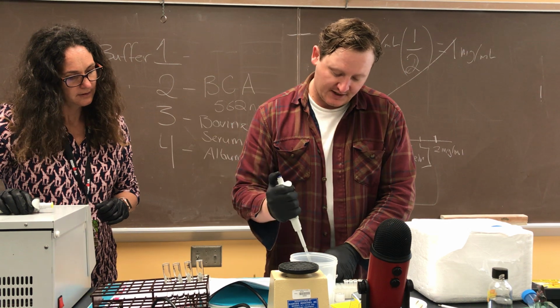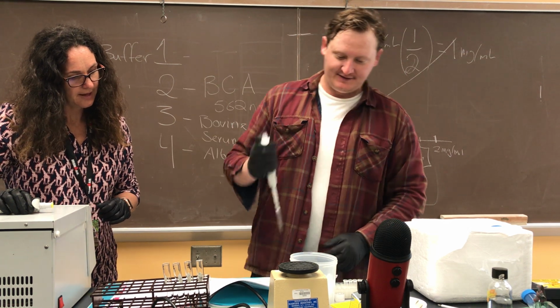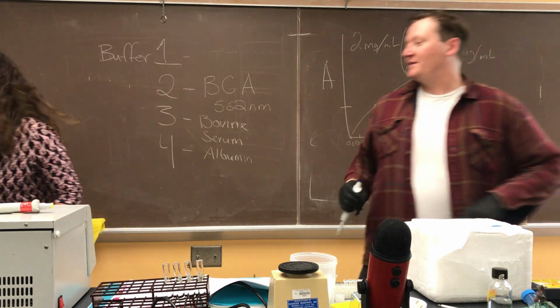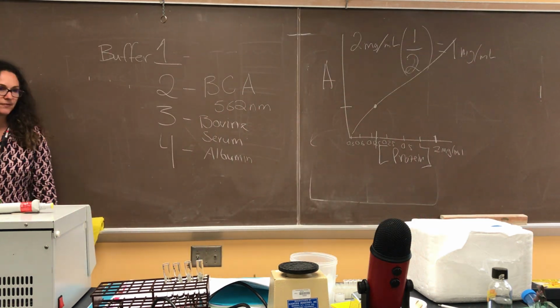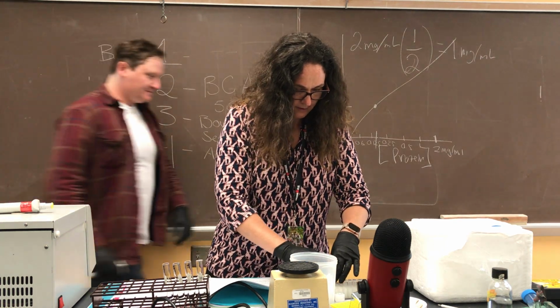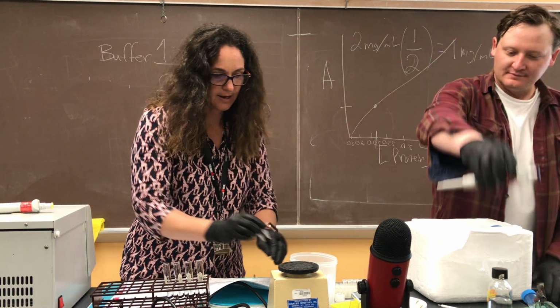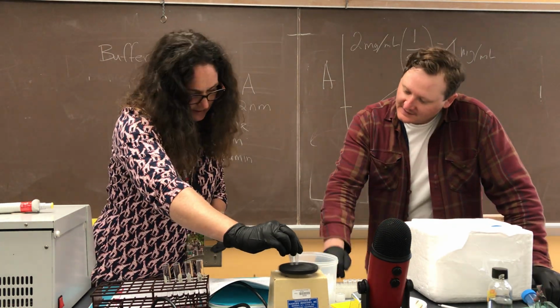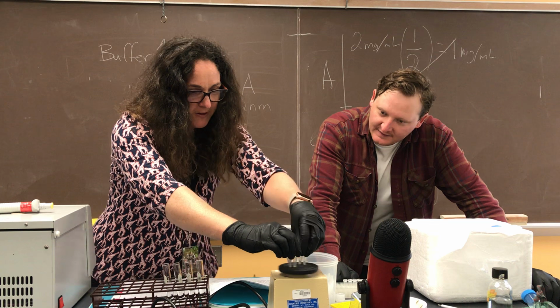And then we get to vortex, don't we? Yeah. Tip disposal. Here you go. Oh, thank you. Okay. And then vortex. Try and resuspend. We can do them all at the same time. Yeah.